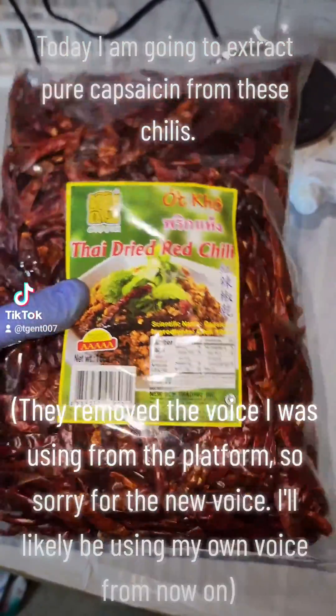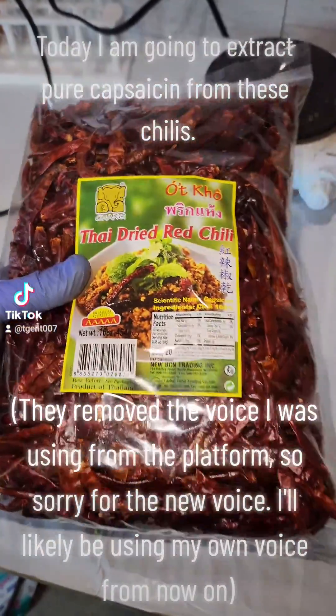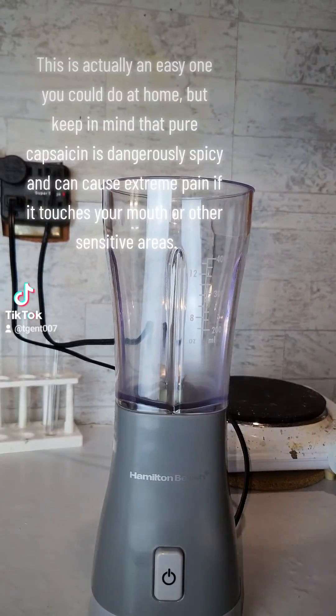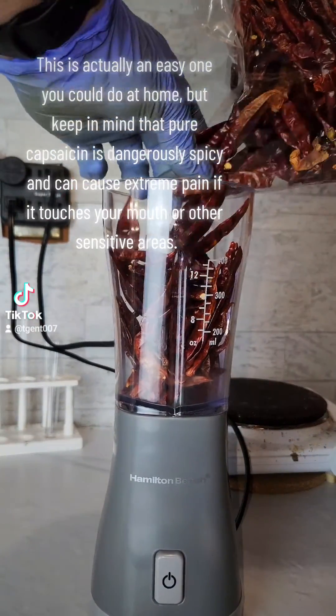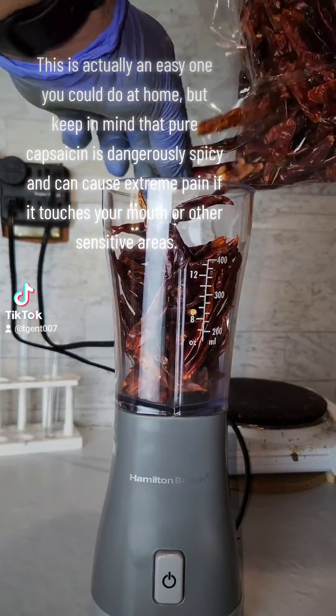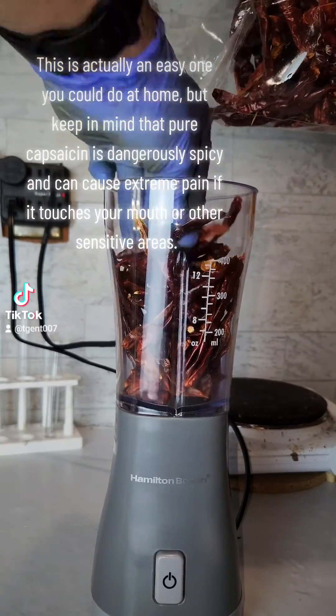Today I am going to extract pure capsaicin from these chilies. This is actually an easy one you could do at home, but keep in mind that pure capsaicin is dangerously spicy and can cause extreme pain if it touches your mouth or other sensitive areas.